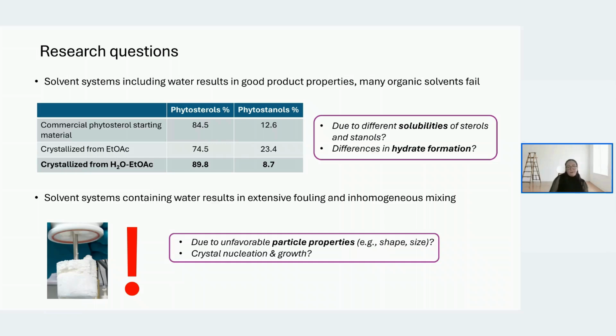And obviously, we wanted to understand what is behind this. And also, can we, by tuning the process conditions, somehow impact these obtained particle properties? Like, can we impact the shape or size of the particles? And again, how is the crystal nucleation and growth during the crystallization?